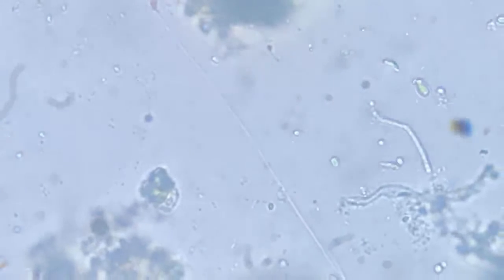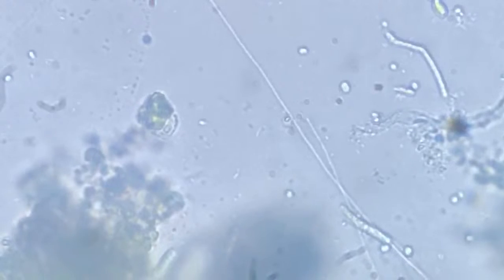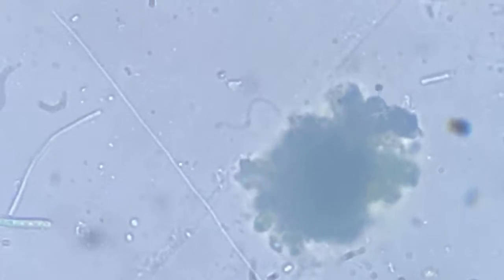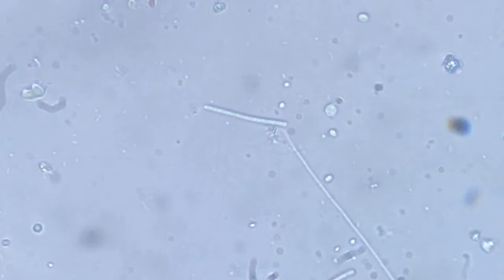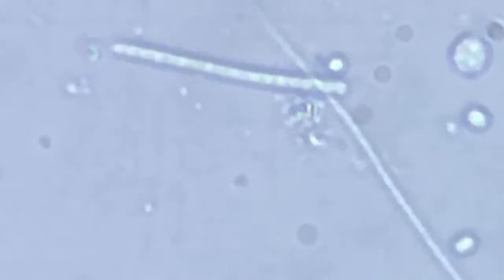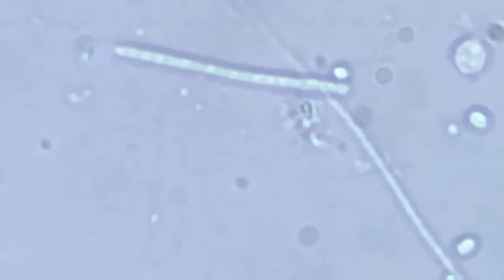Here is another one. And they are very strong, because once they move, if there is any debris in their way, the debris gets pulled along. We are trying to follow this one, but it's going into the debris. So we leave it and try to track this one. It is not moving. I don't know whether this is the head. Okay, this was the head portion because now it has started moving. We can make out that it is moving because of the streaming.